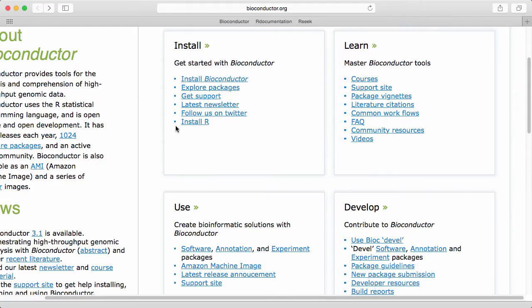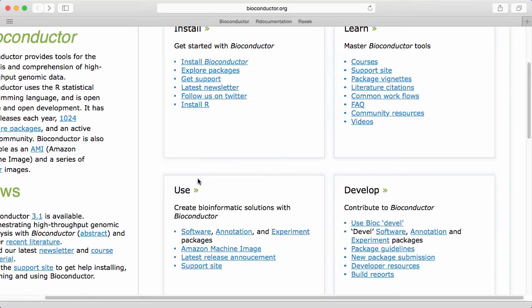Usually when I go to the Bioconductor website it's to find information about a given software package. So down here under use we have software.